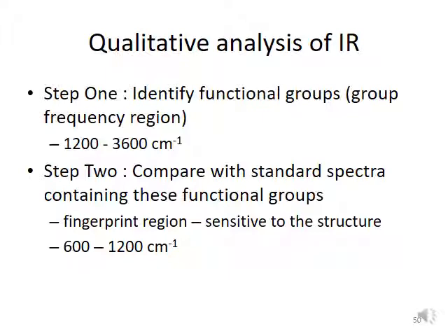The second step is you need to compare with a standard or with the database in the computer, and you investigate the range between 600 and 1200 per centimeter.